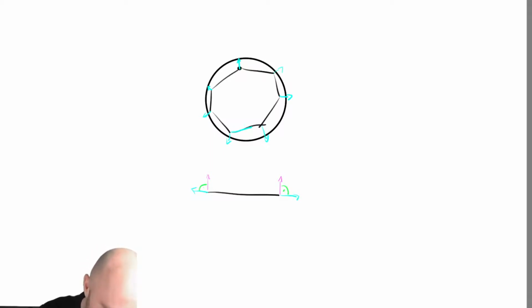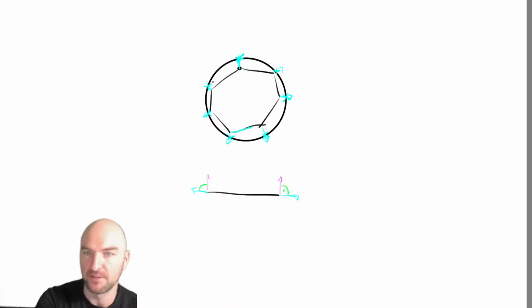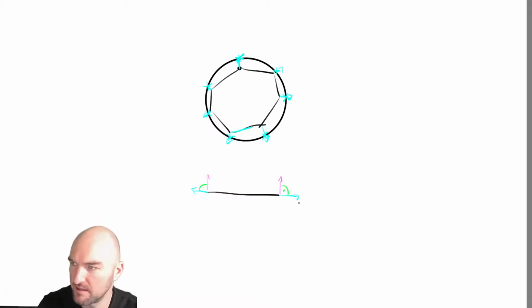Anyway, it then goes and along this vector finds the intersection with, well, any mesh. You can use it with any mesh, but usually we use a boundary, some kind of hull. But you could stretch any mesh to any other mesh. Doesn't really matter. But usually we use boundaries, and then it just moves it out there. And this is essentially all there is to it.